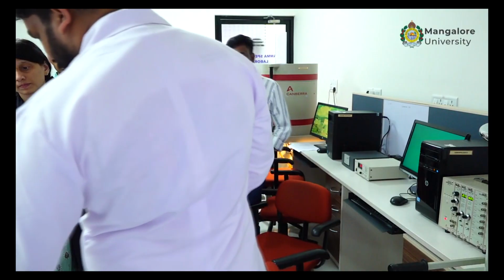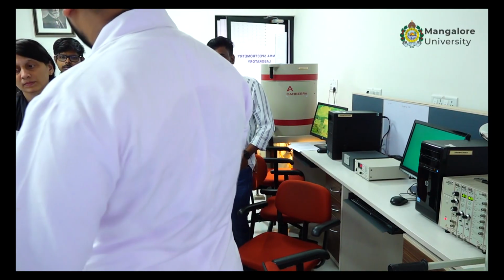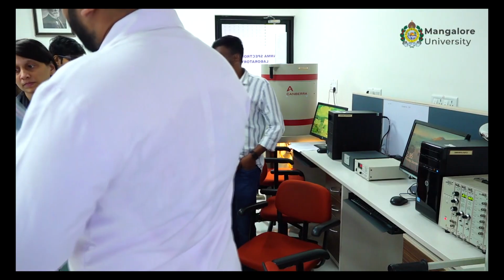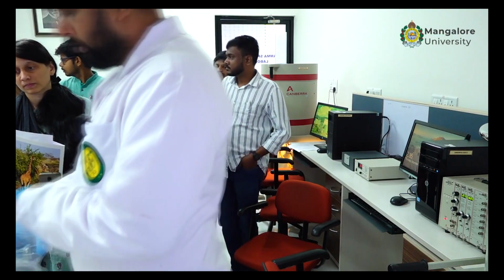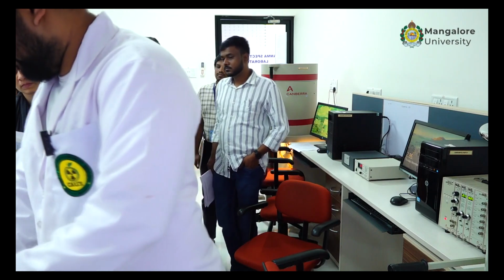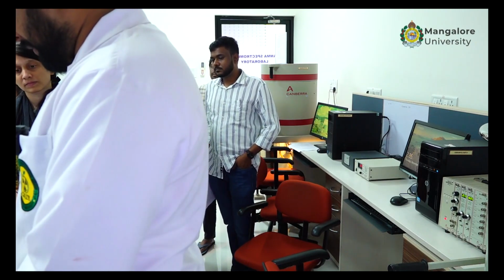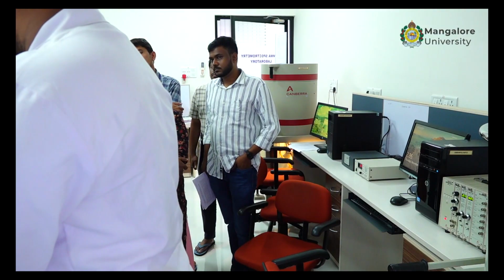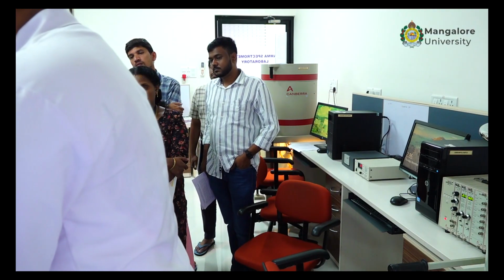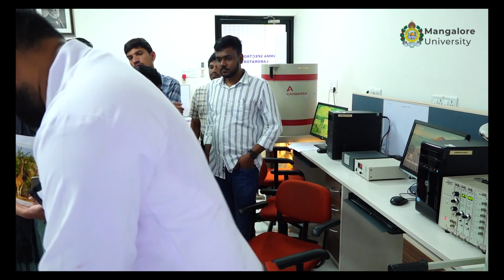So before keeping it in, I have to ensure that it does not spill. Give me that IAEA report 2024. So let us make sure it does not spill. So this one works. If you want, you can just remove the air from this, and now your sample should look something like this.